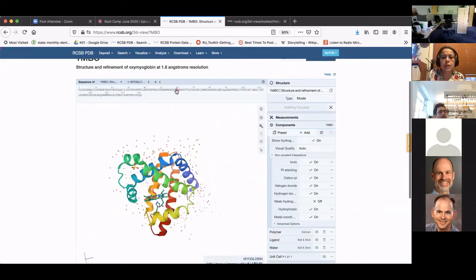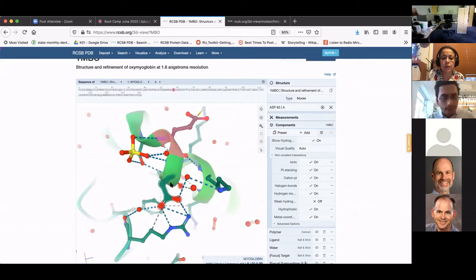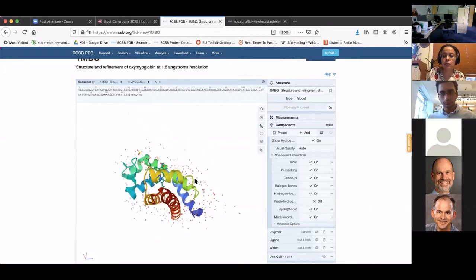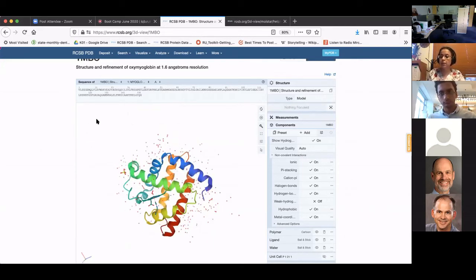So I can just click on residue number 60, and it's showing up as ASP, and then it's showing all the various interactions. But if I wanted to select a whole stretch and maybe hide it or color it differently or whatnot, then I think it is easier to, and notice if I click anywhere outside in the white space, it deselects it.